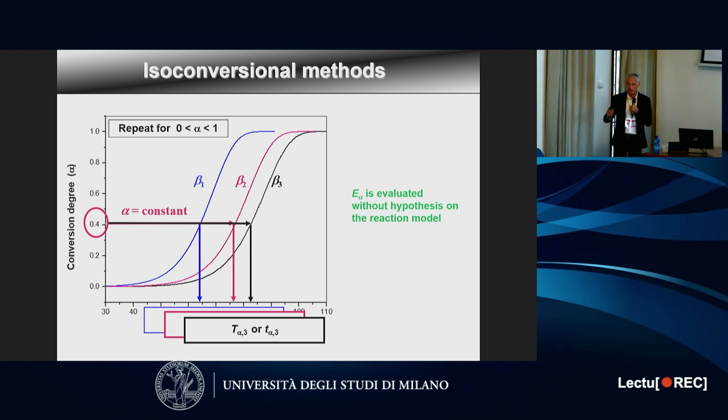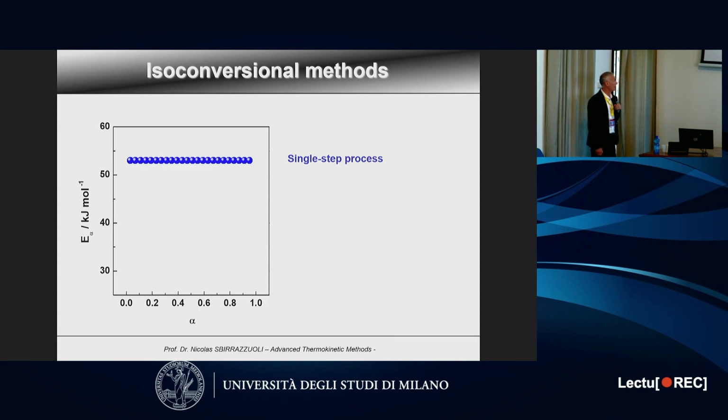You have many possibilities, many functions that you can select, and you always obtain a good fit of the data. So for model fitting, it's okay. But if you want to get some information with physical meaning on the parameters, it's much more difficult. That's why the information that we can obtain with model-free kinetics is very interesting, and then we can combine the two approaches to go further.